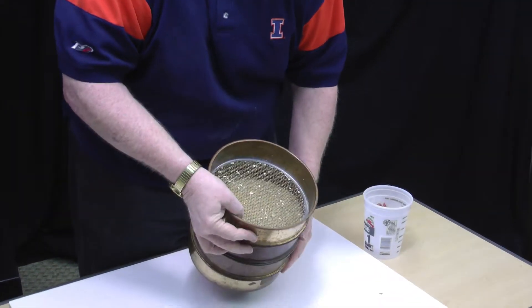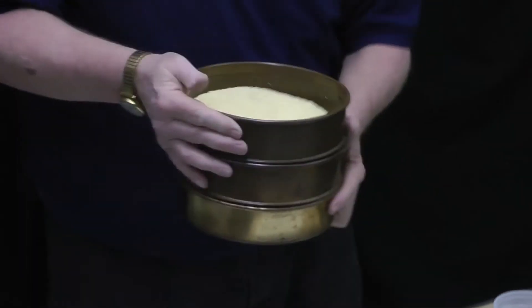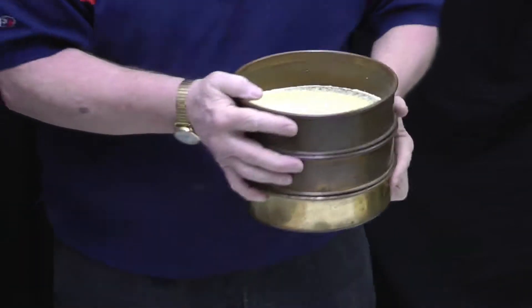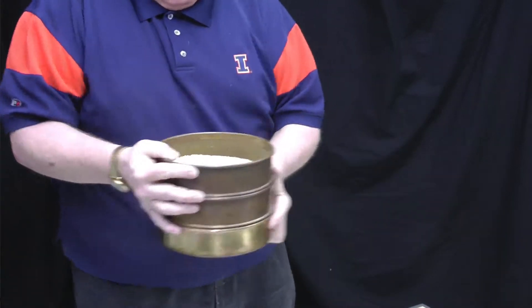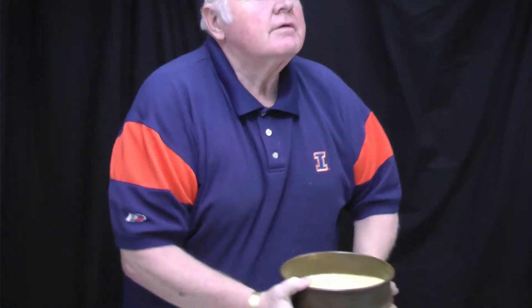The first screen we took off — we see it's pretty well done. We're done with our second screen; very little product on that. We then go to our third screen and now we have a lot more particles. I move it around with my hand to make sure all the grain had access to go through the holes on that third screen, and once we're done with that we will take it off.